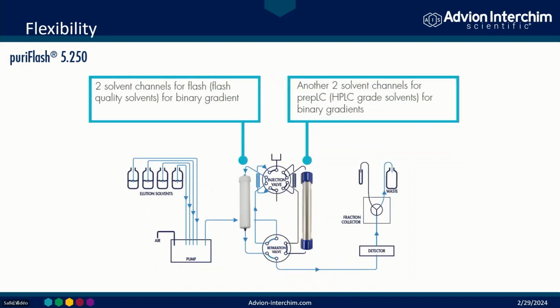The last slide represents the fluidic of the system equipped with 2 column holders, from the pump to the collection valve. With the 2 valves, and as an example there, one position is equipped with a flash column and the other with a preparative column.